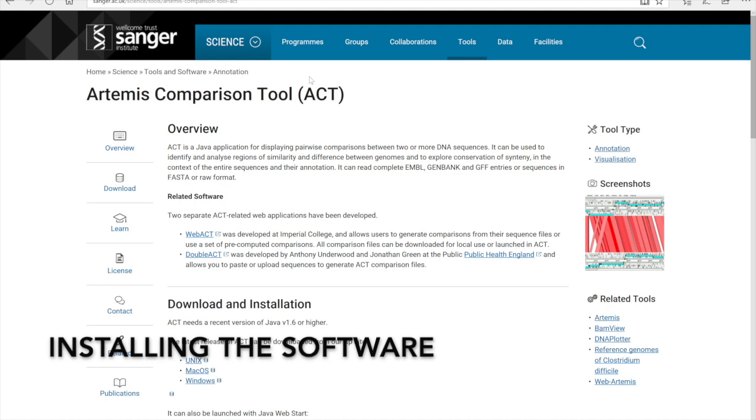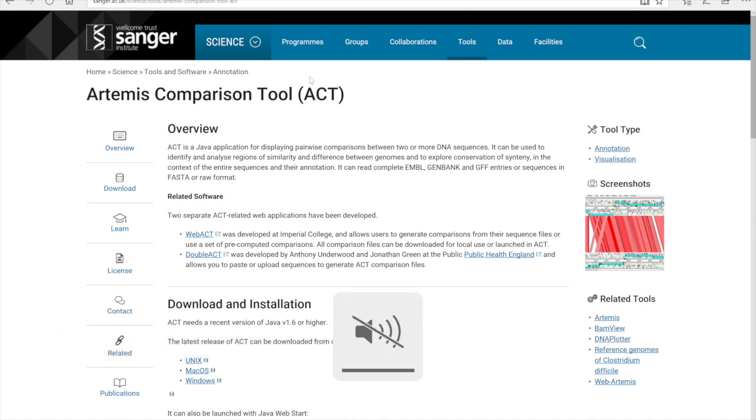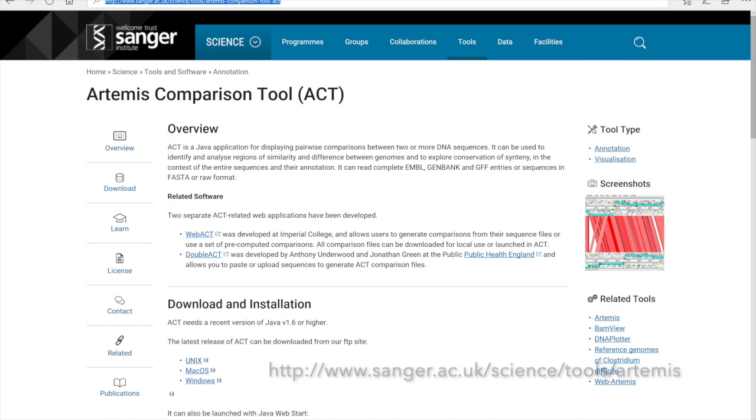What we're doing is that what I'm doing here is just adding on a few extra things so that I'm sure that you're going along the right track. First one just to talk to you about is downloading the software itself.